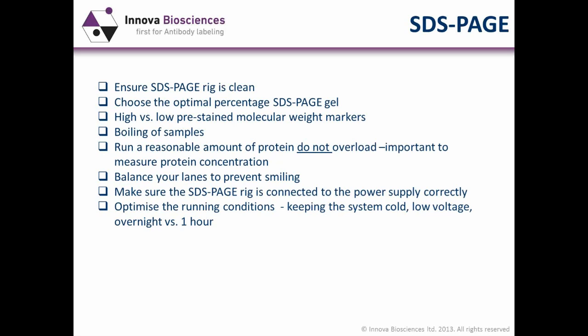And a lot of this can be optimized through spending your time at the desk looking at the internet and reading the research papers to understand what other people have done. Generally when I was in the lab, I had many people contacting me from other laboratories who were having the same issues with this exact protein and asking how I managed to optimize conditions. And generally with the scientific community, people are more than happy to offer their hints and tips, and this has been very successful in generating more literature for publication.